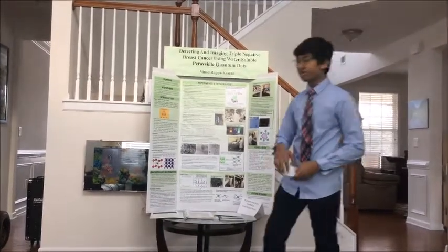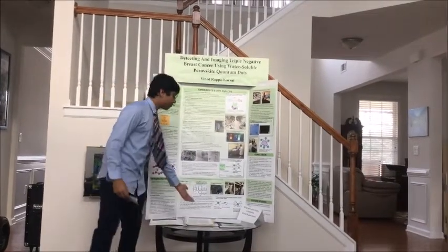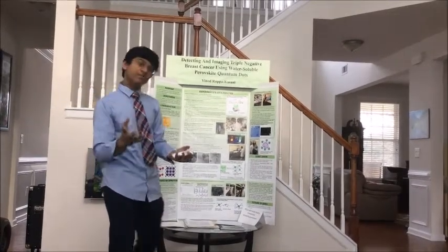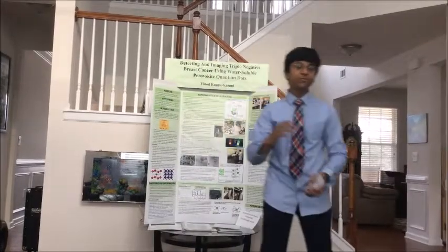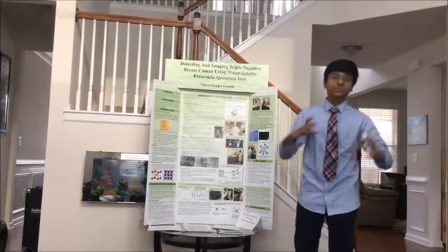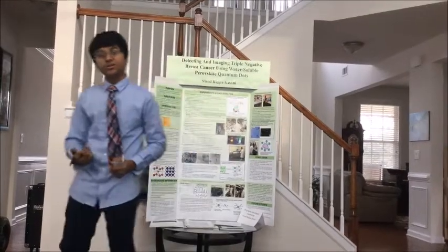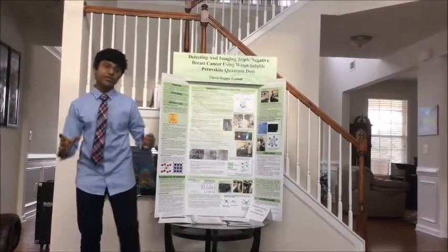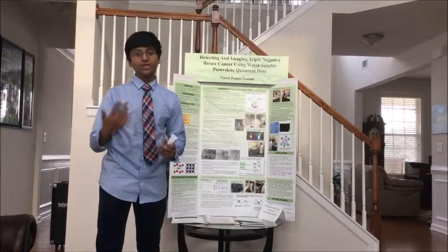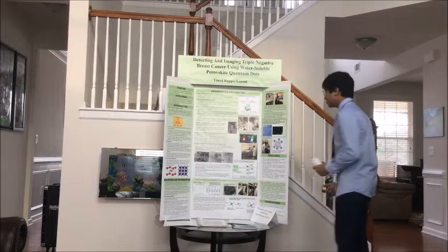The main goal of this is for the anti-CD63 antibodies to attach to the perovskite quantum dots and crowd around them, so that when the perovskite quantum dots are added to a sample of the triple-negative breast cancer exosomes, they will crowd around the exosomes because the anti-CD63 antibody is present on the perovskite quantum dots. The whole goal is for them to crowd around the exosomes and give a bright luminescence, because all the perovskite quantum dots have lots of luminescence, and when they crowd around something, they'll be concentrated in that one area, and you'll see a bright green color.